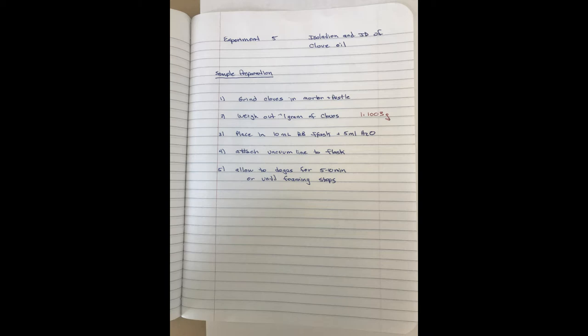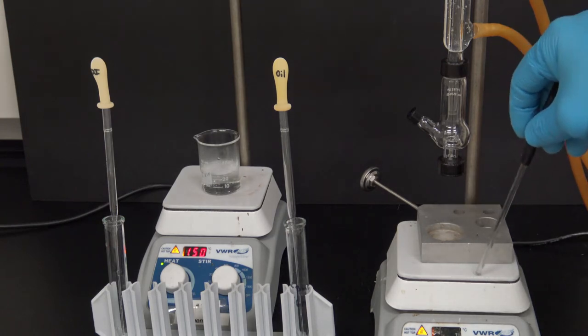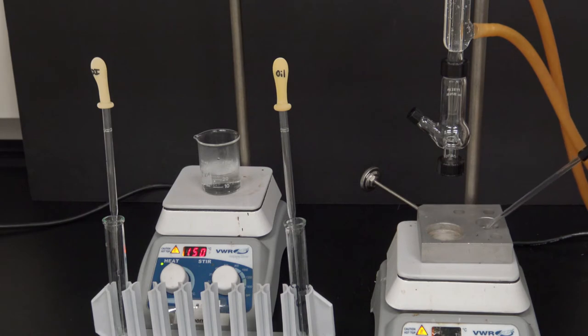This is the notebook page for the first part of the experiment where we prepare the sample. I have all kinds of things set up here in my hood. I have a hot plate stirrer. I have a heating block. I've set it up with my Hickman still and my water jacketed condenser.